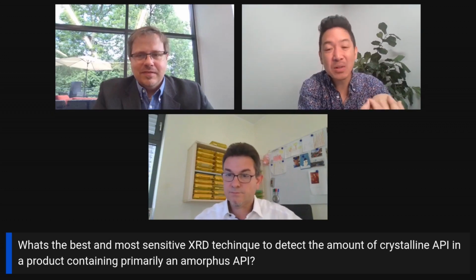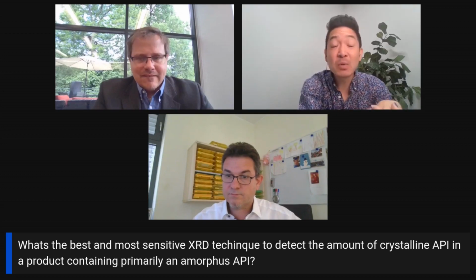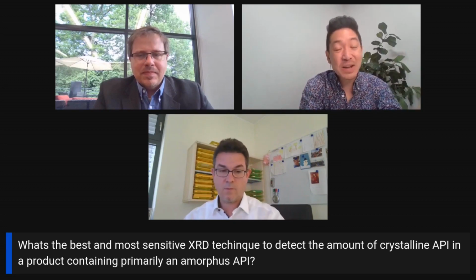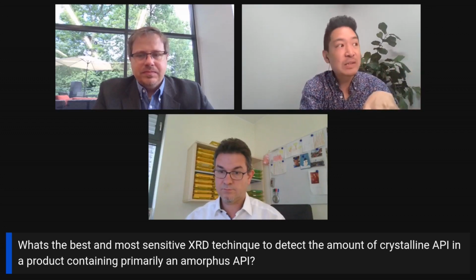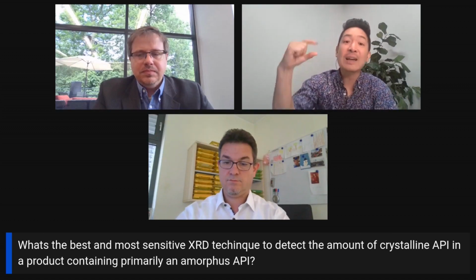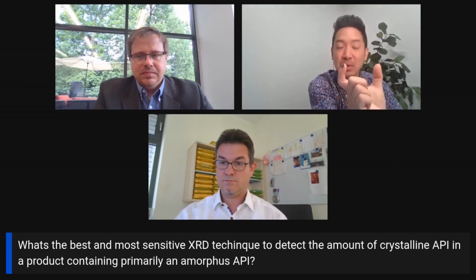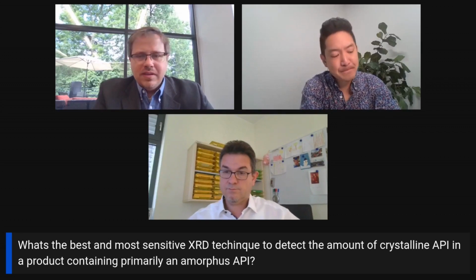If you were looking at a small amount of crystalline API, the challenge is often homogenization. You want to make sure that the material is fully illuminated by the beam. And the best way to make sure that you're analyzing everything is to hit it with a very, very broad beam. So one of the things that we're seeing more often is the use of a variable divergence slit rather than a fixed divergence slit, which actually increases the size of the beam as a function of scanning angle. So it keeps the whole sample illuminated, which can really help out in terms of overcoming some of these challenging statistics.